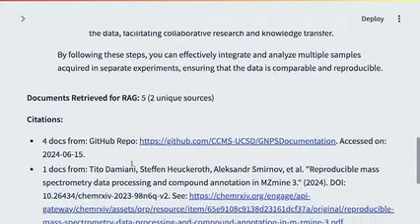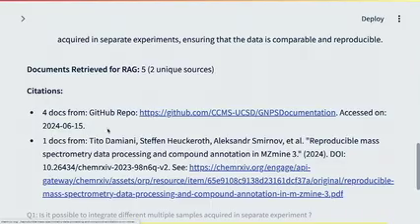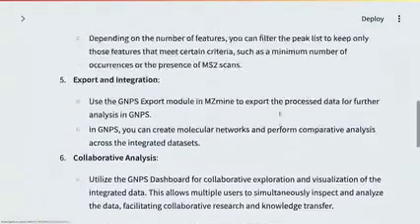So an important part of this chatbot is that we can track the original source of the information. So one might be interested in looking at this article, but also at some documentation provided on this website. Okay?